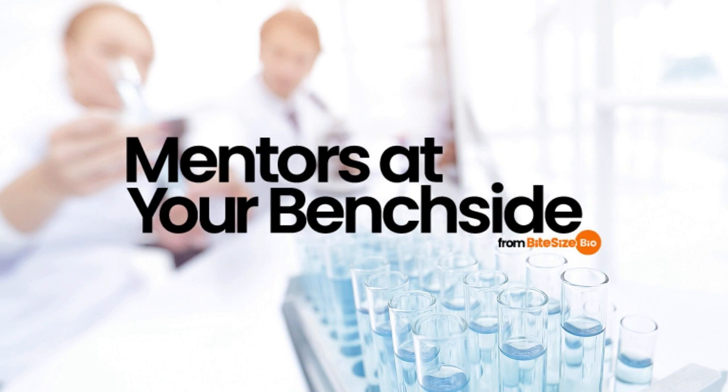And our final tip is to perform a measurement system analysis. While this is a relatively complicated method to gauge accuracy and precision, measurement system analysis, also known as gauge repeatability and reproducibility analysis, is the most comprehensive and statistically sound way to get a complete picture of the accuracy and precision of your measurement. This technique mathematically determines the amount of variation that exists when taking measurements multiple times.